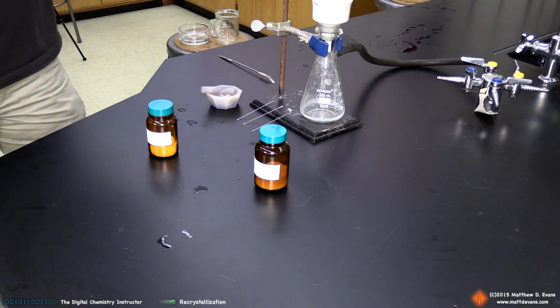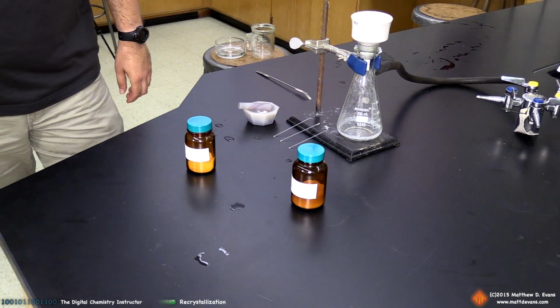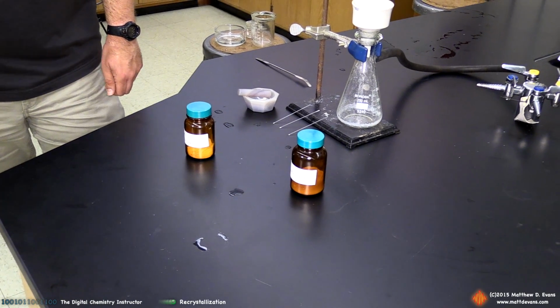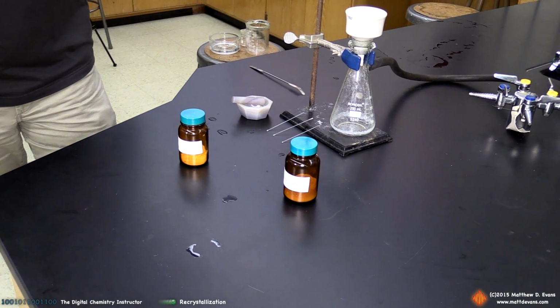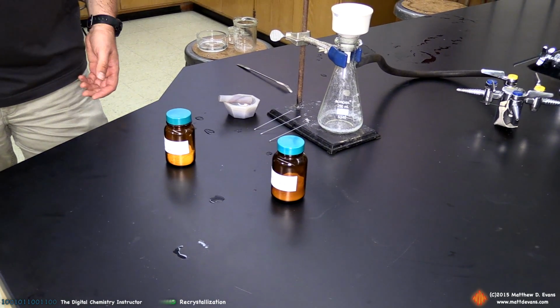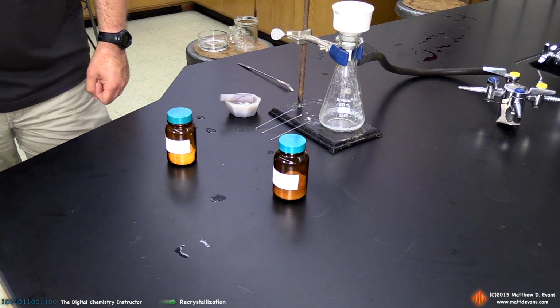Now we're about to do a melting point. Melting point is the official method for assessing the purity of solids. It's a really important technique. We're going to be doing a lot of these this semester. So judging or obtaining the melting point for our sample, if it's right on with literature, it means we did all right, it's pure, and we'll check that now.